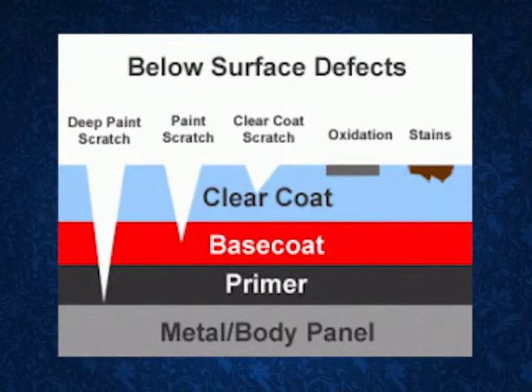Samples which are neither restricted by the amount nor by the condition should then be analyzed in such a manner that the analysis will actually determine the color and texture of the paint, as well as the number, order, colors and texture of the layers in case the sample is a multi-layered sample.